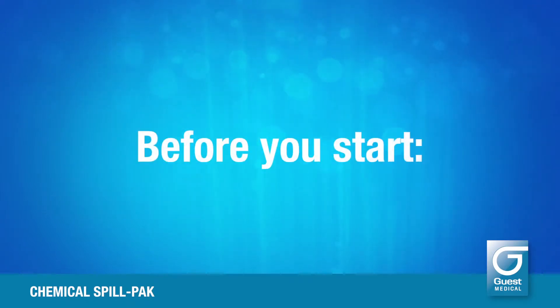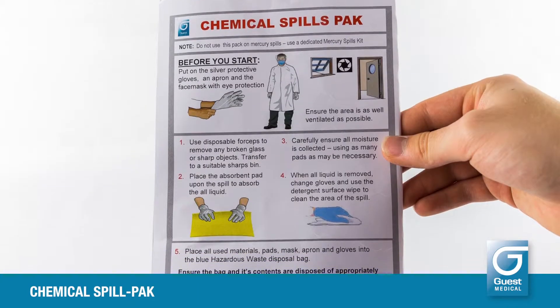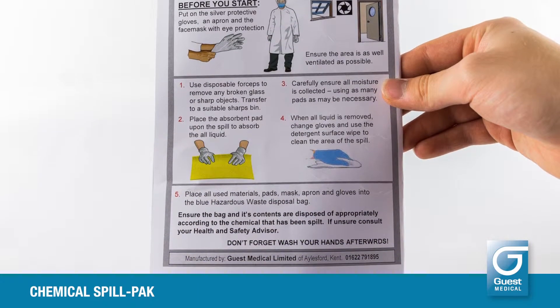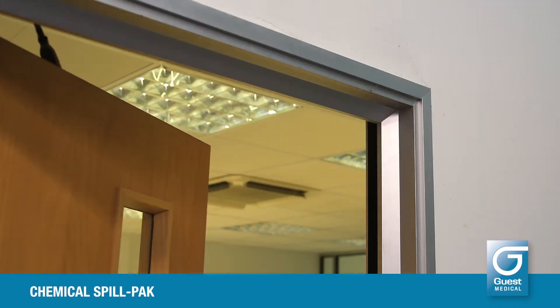Before you start, read the instruction card. You can see it from the outside of the pack. Wherever possible, improve ventilation in the area of the spill.